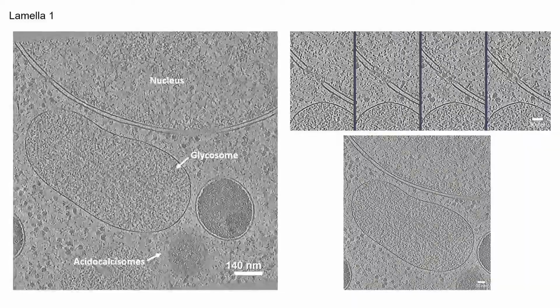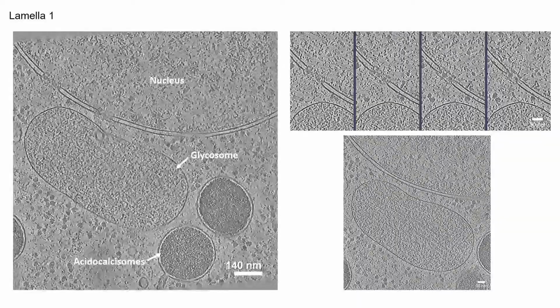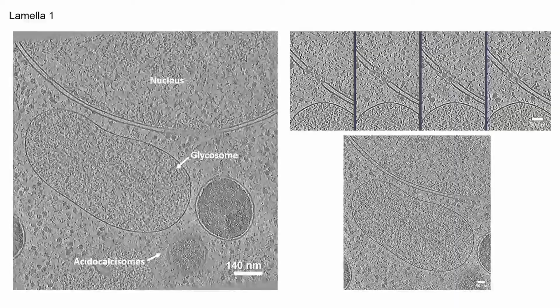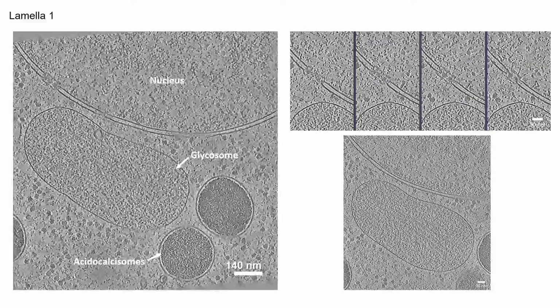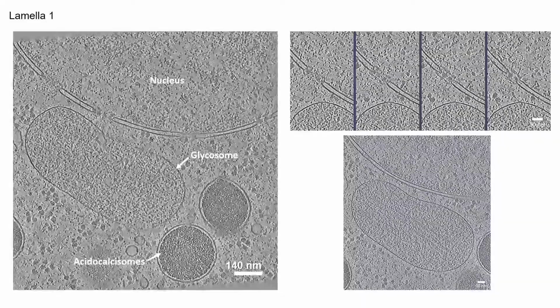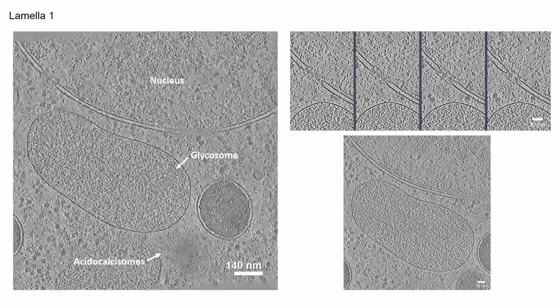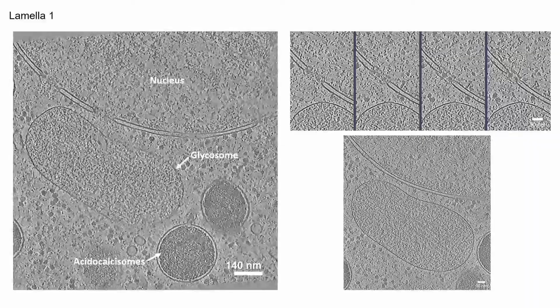And we can clearly see the nuclear pore of the cell. So here is a sequence of Z of this tomogram, and here inside the glycosomes we can see some fibers. I don't know if you can see, but I can see some fibers here inside these glycosomes. That was really interesting because we never saw these in the other models.